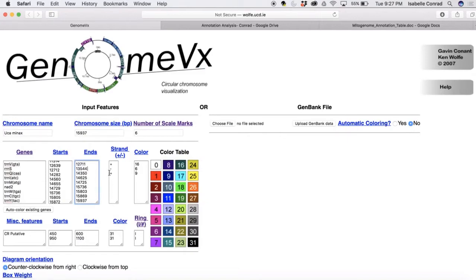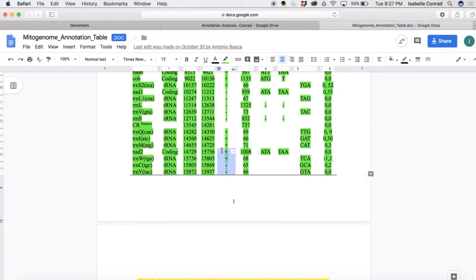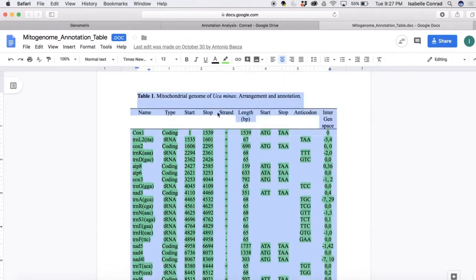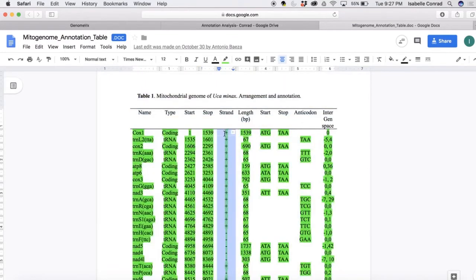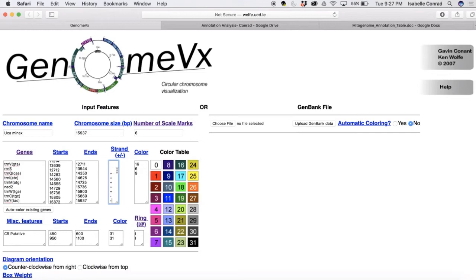And now we're going to go find the strands plus or minus forward reverse from the annotation table. So just again, copy the whole column and paste it into the website. So delete the extra space, and then also delete the space that was left where the control region was.